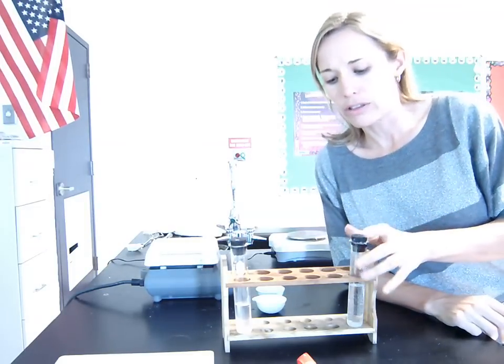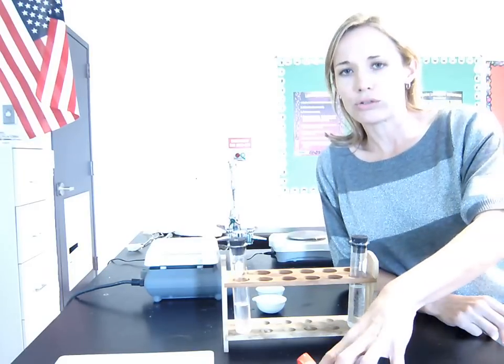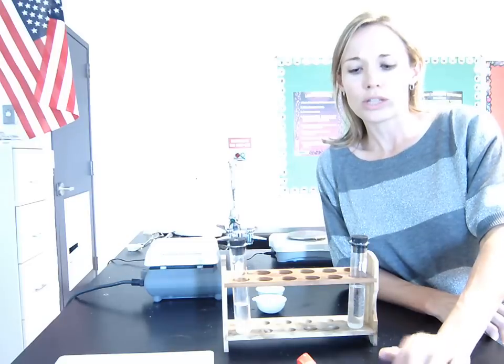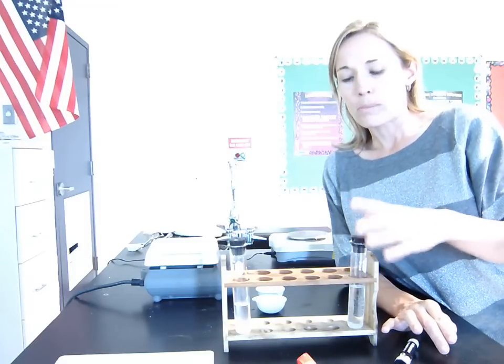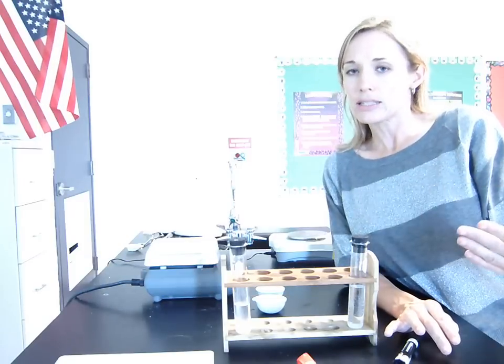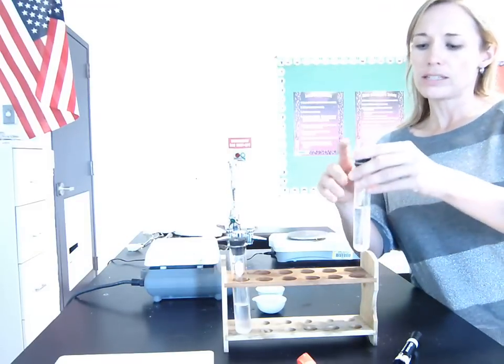So let's look at the title of the lab, comparing the concentrations of saturated solutions. There's really two key vocabulary terms there. The first one is concentration, and the second one is saturated solution. So let's start with saturated solution. In yesterday's lab 4.1, the main point was to create a saturated solution and for you to see what that kind of looks like. So what we've done today is we've created two saturated solutions using two different substances.